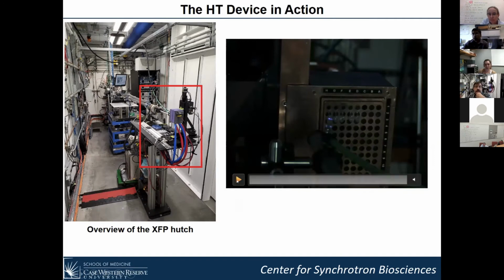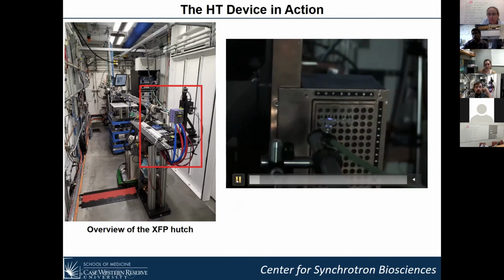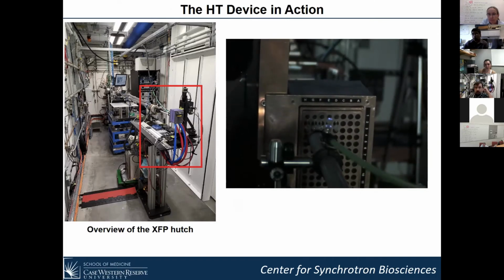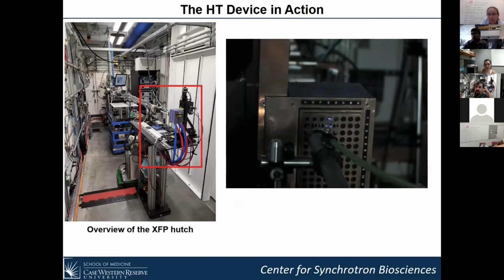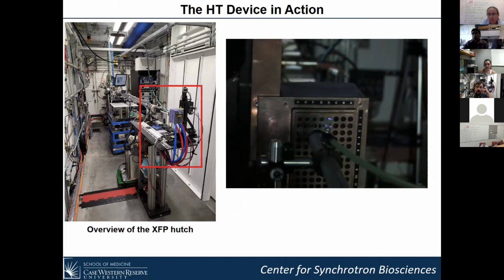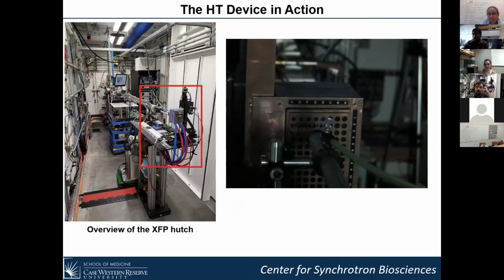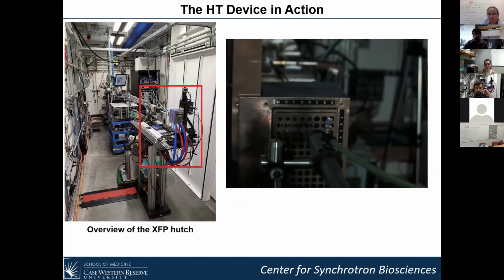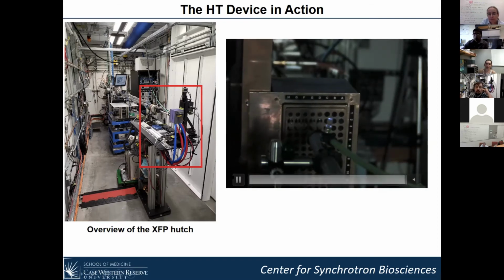This just shows it in action. It moves into each position, and then the fast shutter fires, and that's a view of the actual ionizing pink beam at each shot. These are relatively quick, so they may or may not come through. We can do an entire plate in about 5.5 to 6 minutes, depending on conditions.